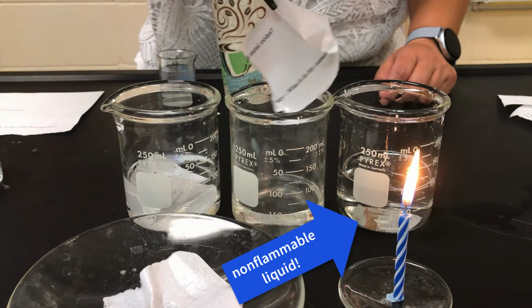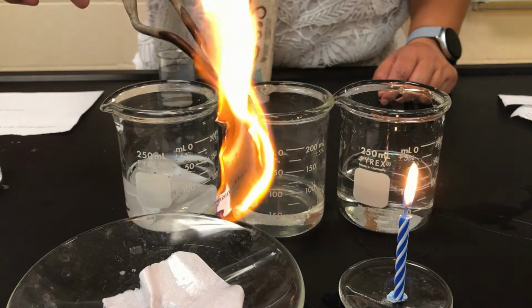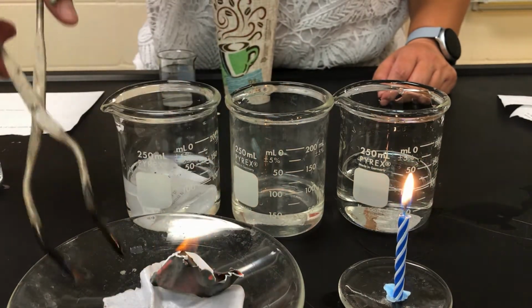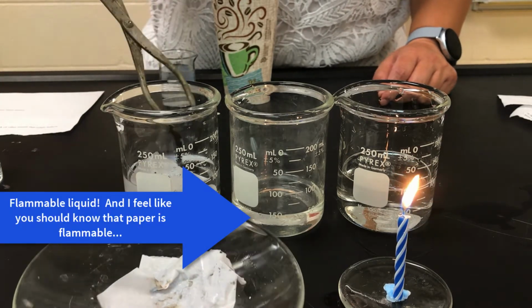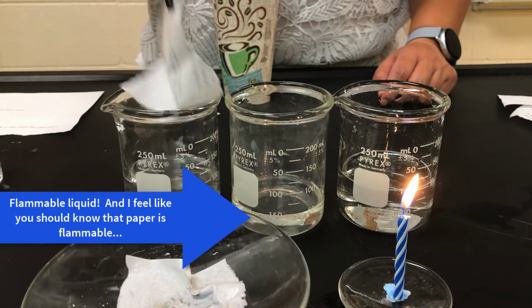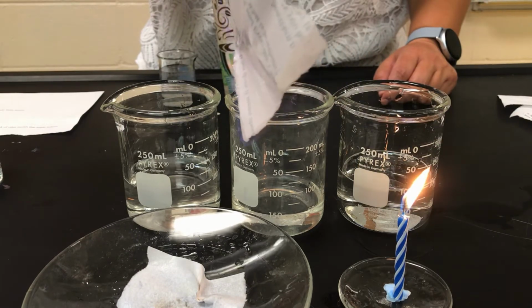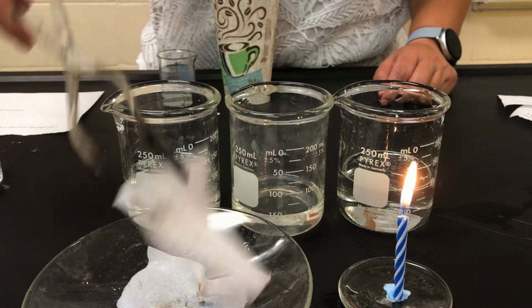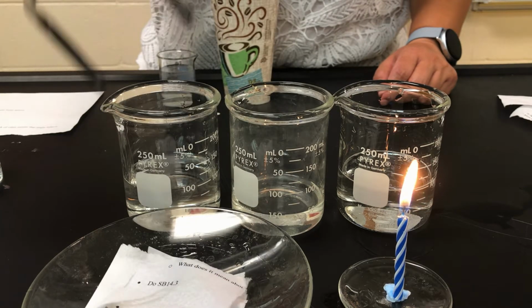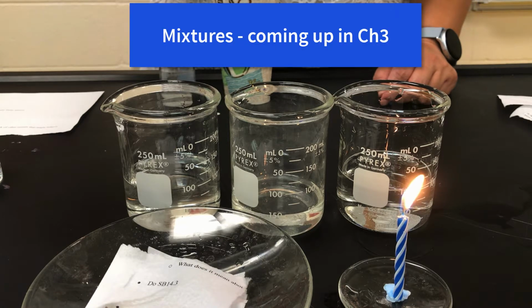Now we take the paper from beaker number 2 and we subject it to the flame, and lo, it is definitely on fire. You'll see that clearly there is fire before the paper catches fire, right? And what does that tell us? And now we're going to take the paper from C and subject it to the flame, and clearly it catches fire, but the paper does not burn. Oh my goodness, this is a property of mixtures. Yes, wherein mixtures have the property of all the things they're composed of, which is a little bit of liquid A and a little bit of liquid B.